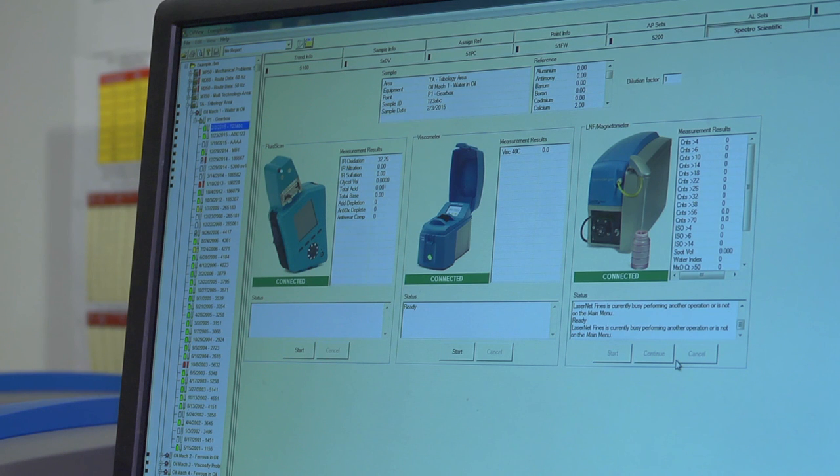It operates very straightforward. It allows an operator to operate all three instruments from the front panel and from the display of this computer, and then allows you to seamlessly import the data. So there's no manually importing. There's no necessity for a flash drive to export data from your fluid scan and then to import it into the AMS database.